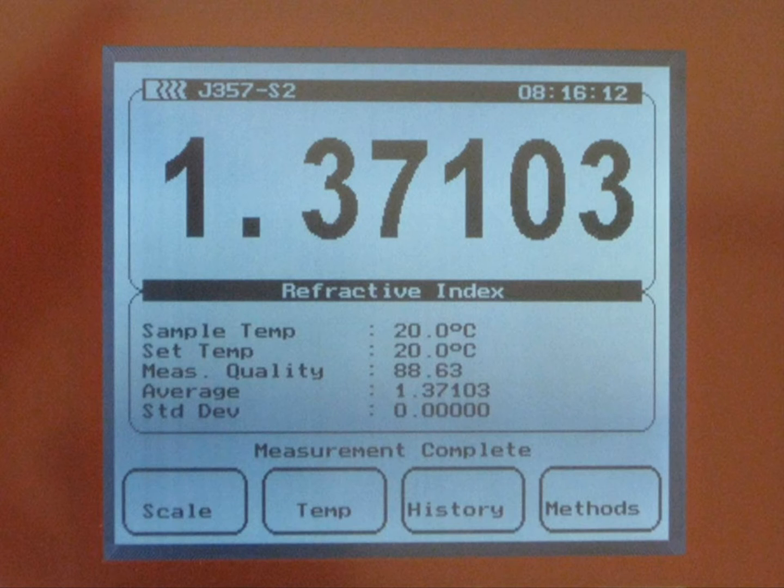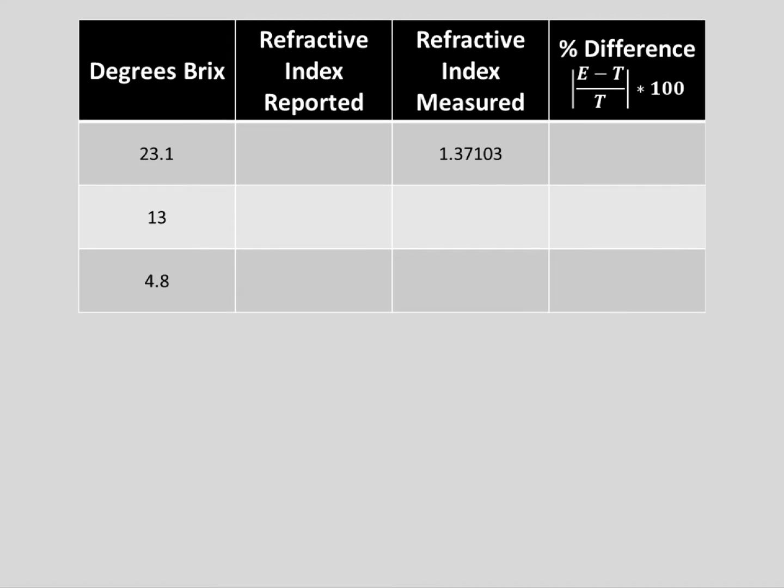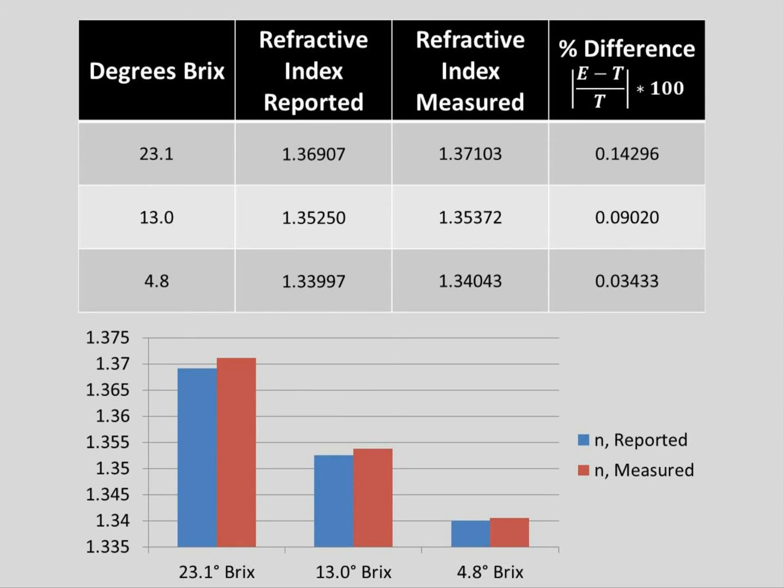Here we see the readout from the refractometer on one of our sugar samples. We can see that it has an index of refraction of 1.37103 after three measurements. We repeated the measurements on the two remaining samples and found values to be 1.35372 and 1.34043. The table values for samples with these BRICS values are 1.33997 for 4.8 degrees BRICS, 1.35250 for 13 degrees BRICS, and 1.36907 for 23.1 degrees BRICS.